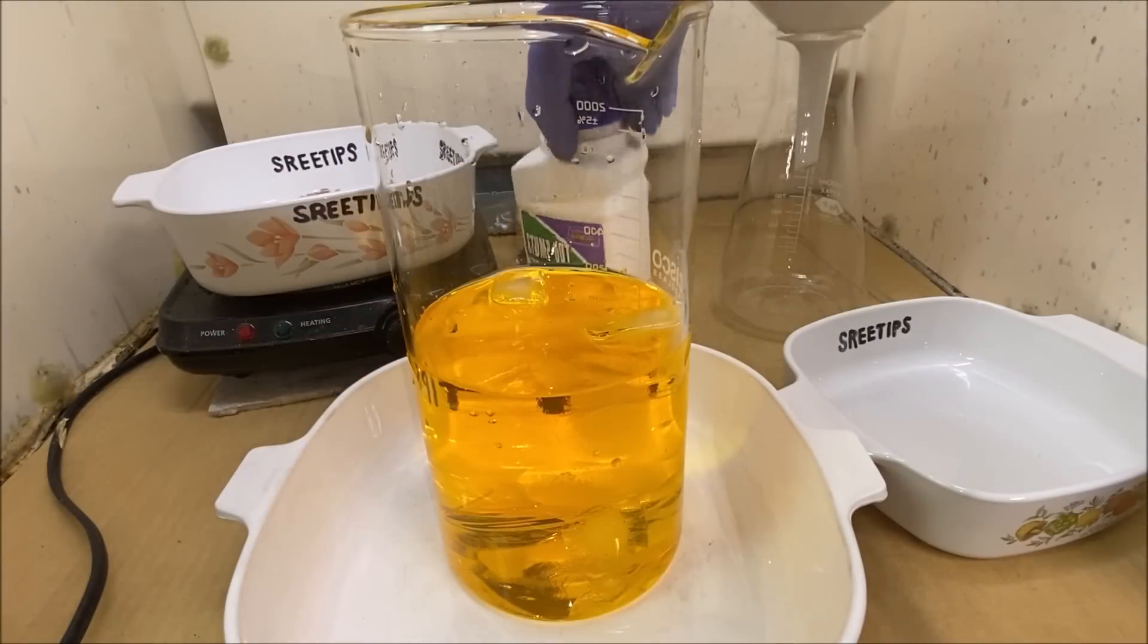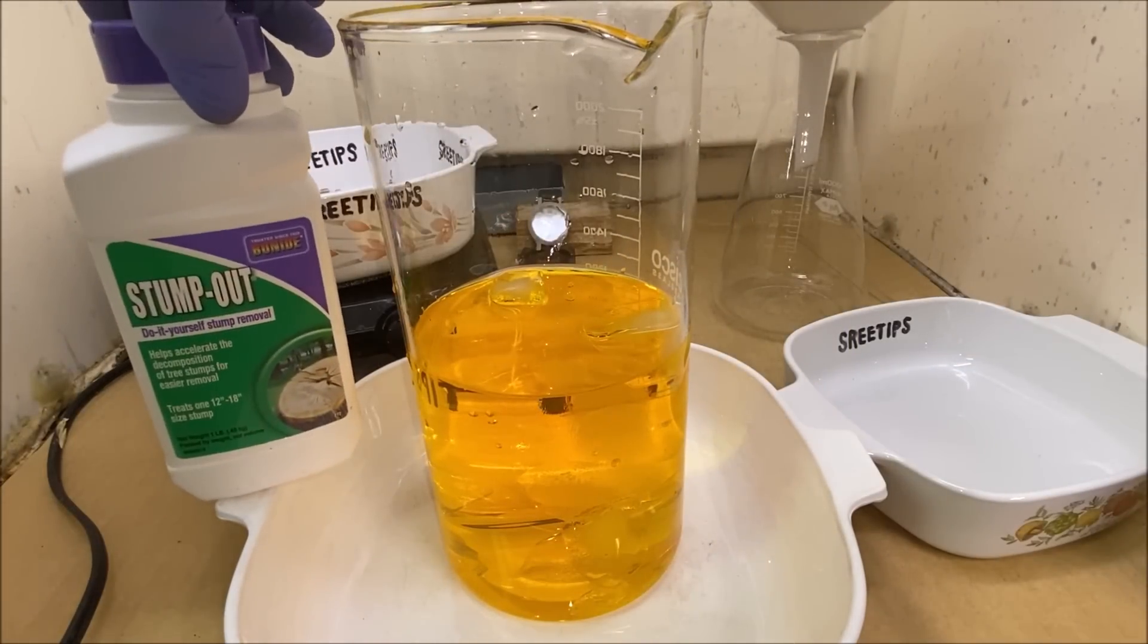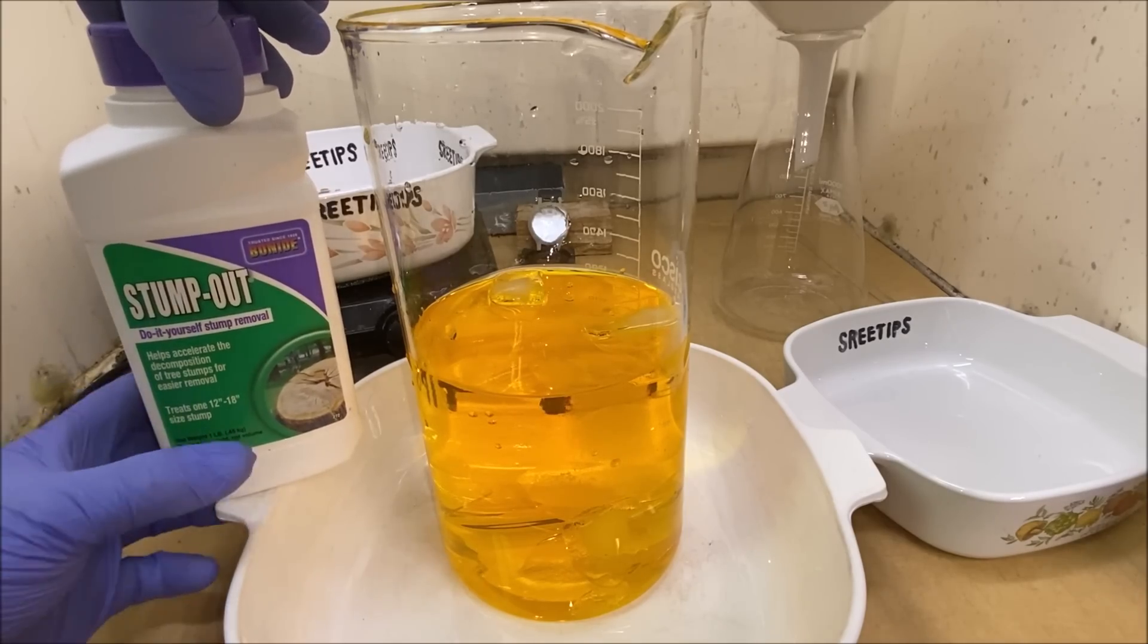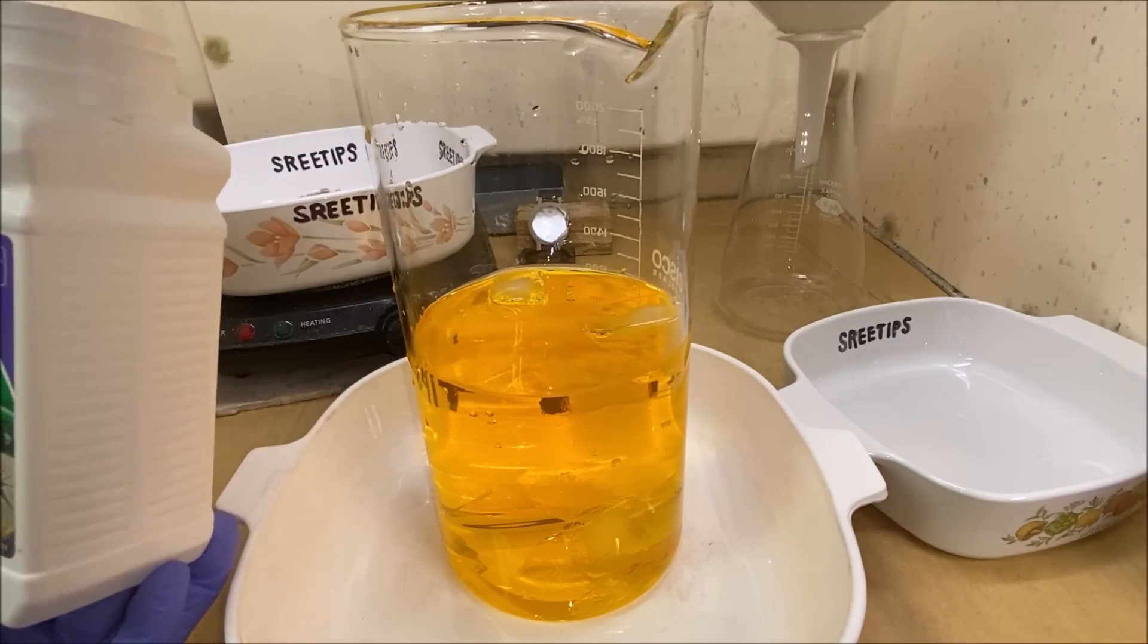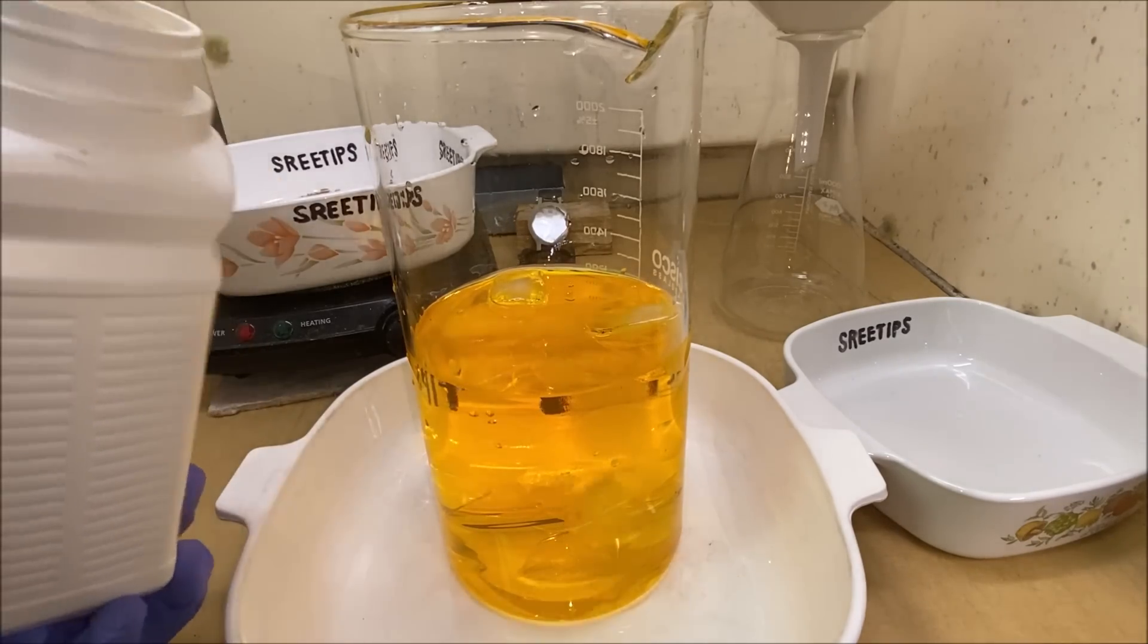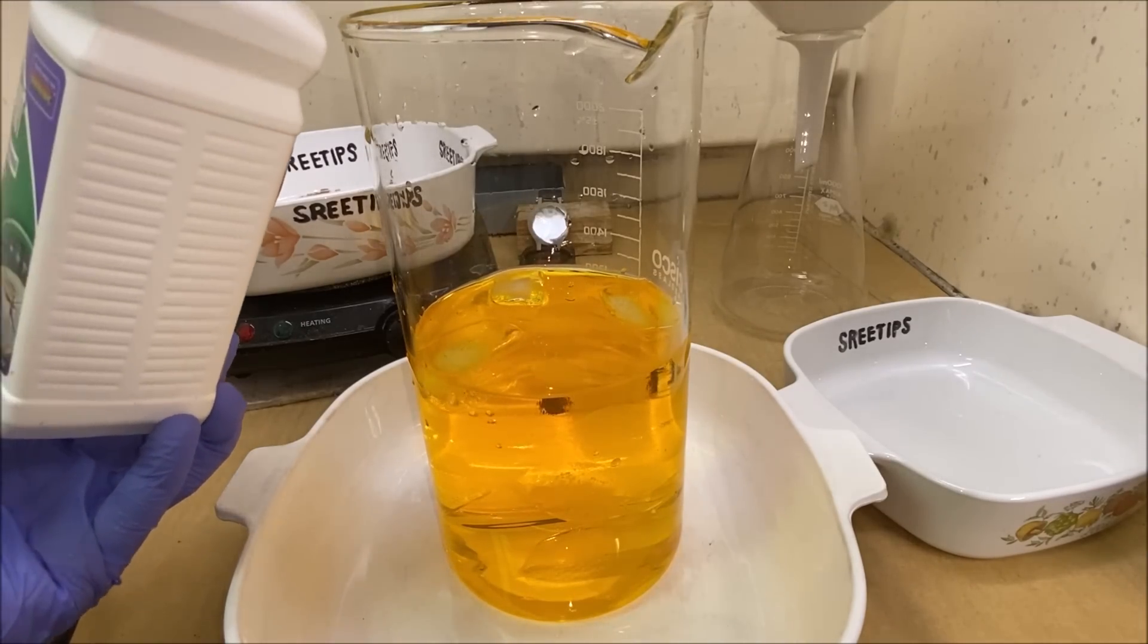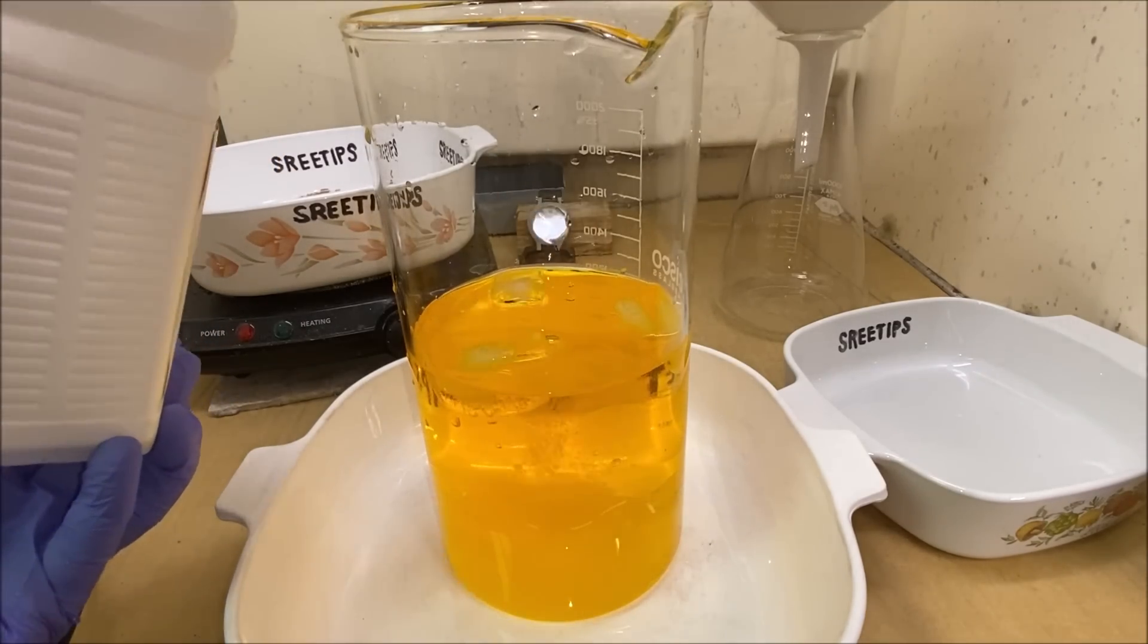Now we're going to add some stump out. Stump out by Bonide, this is sodium metabisulfite. We're going to add this in and precipitate the gold. Here we go, should be about an ounce in here is what I'm guessing.